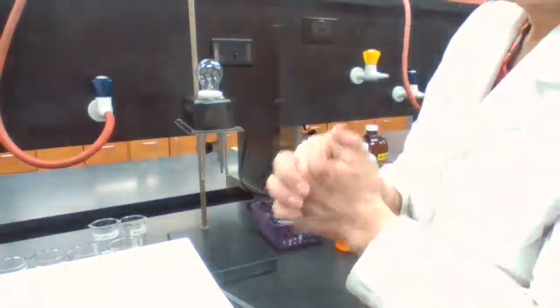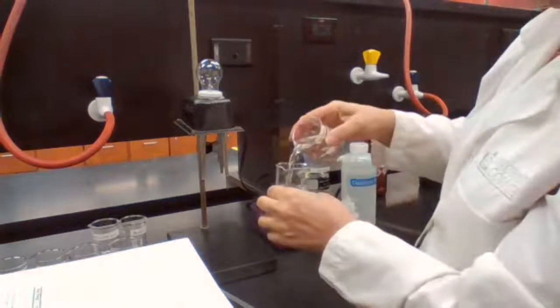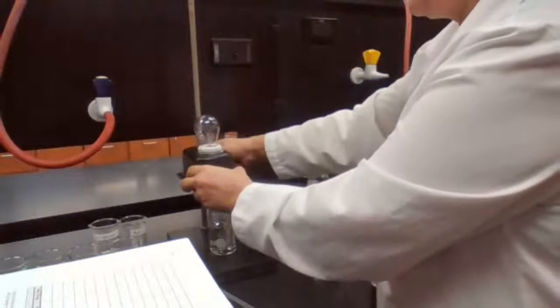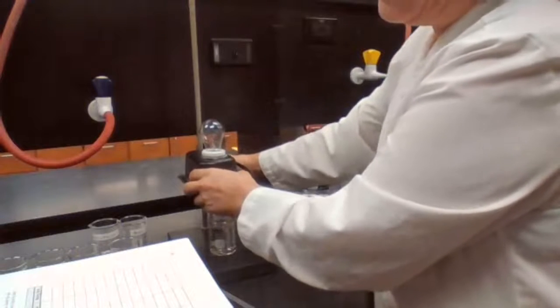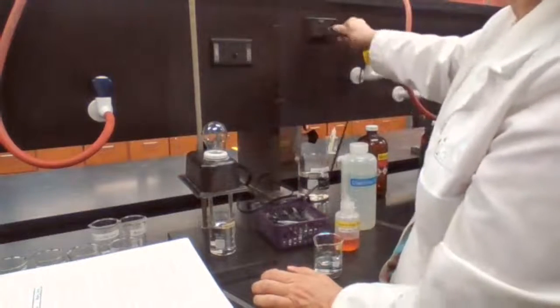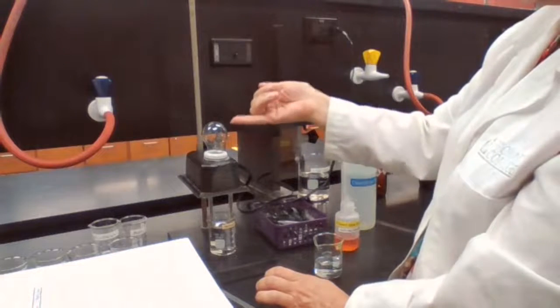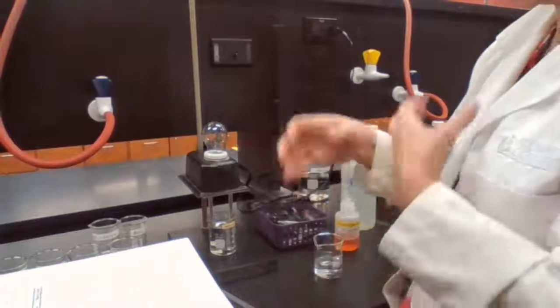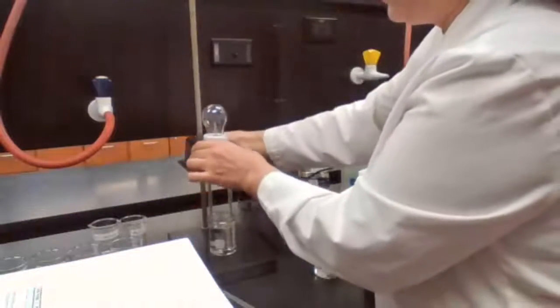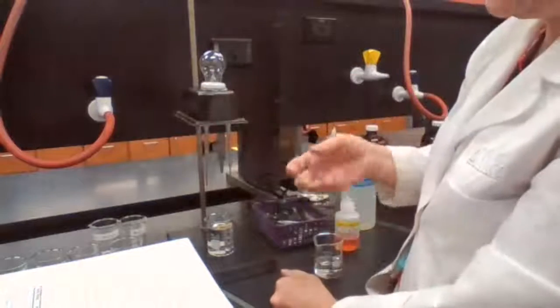Next is aqueous methanol. That means methanol mixed with water. If methanol had dissociating hydrogen, basically like an acid, the hydrogen would separate, generate ions, and then you would see the light. But methanol does not dissociate to ions in water. Some compounds dissociate into ions in water. When you add water, they dissociate.